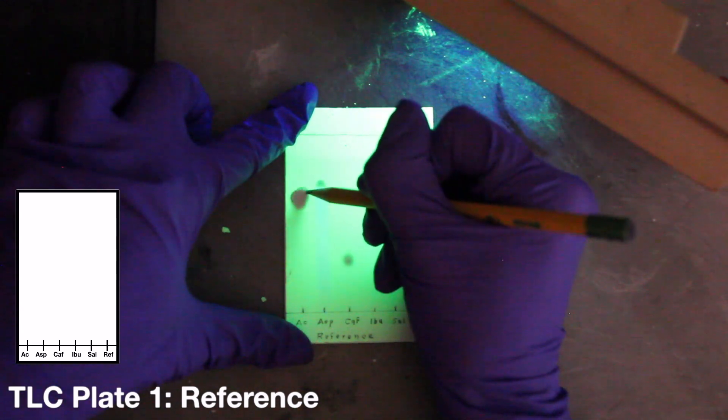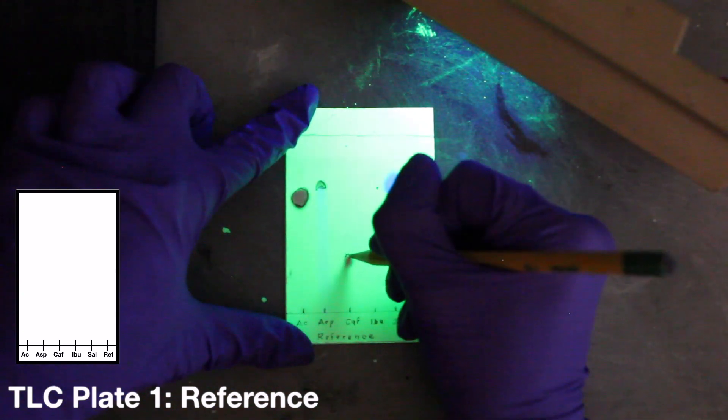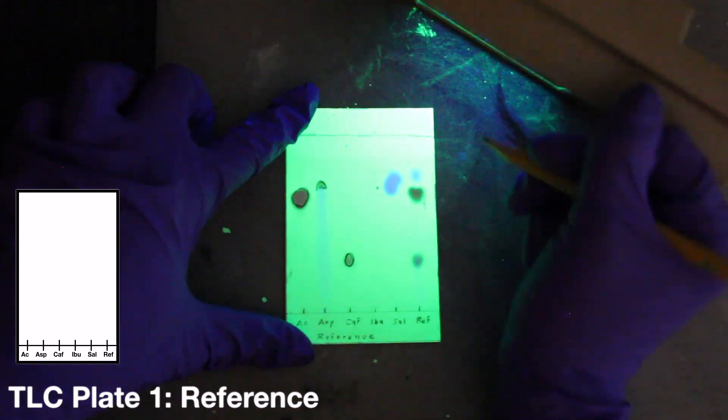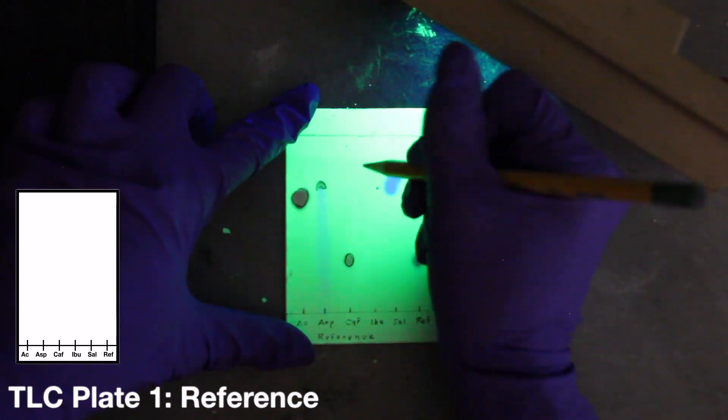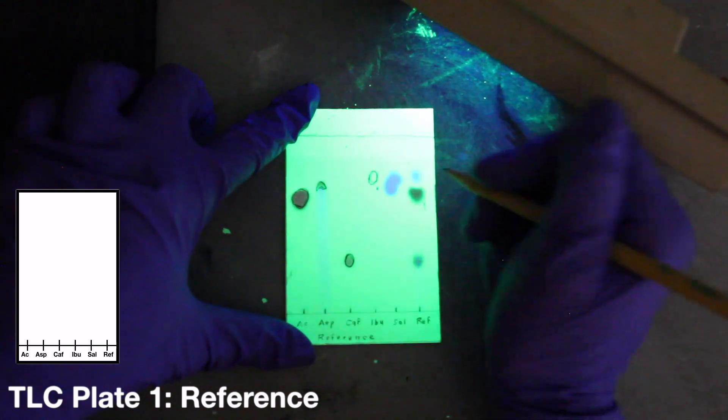You will probably notice that aspirin and salicylamide have very similar RF values, but their appearance is different under the UV light. Make a careful note of these differences as this observation will be useful in helping you determine your analgesic components. At present, over-the-counter analgesics that contain salicylamide also always contain aspirin.